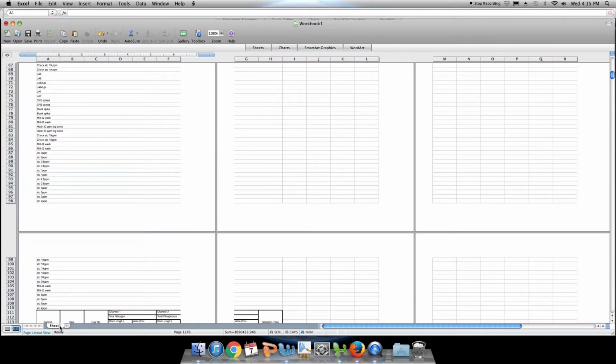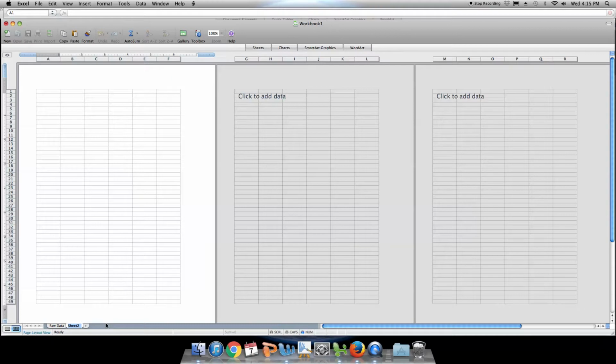We're going to take this sheet and call it raw data. We are not going to do anything with this data. It's just going to remain here exactly as it came out of the FIA. We'll then go to a new sheet, which we will call calculation.